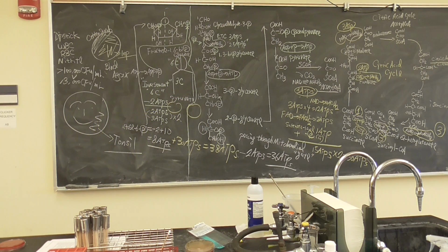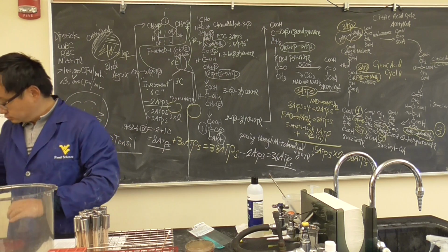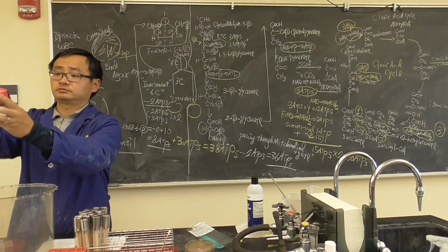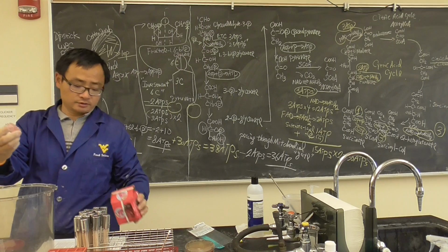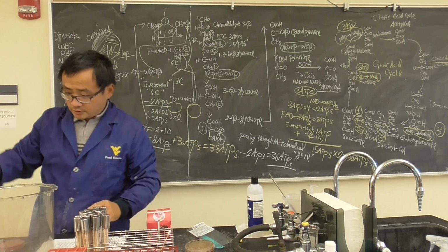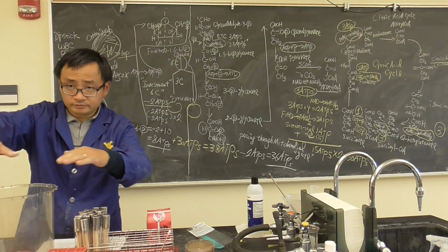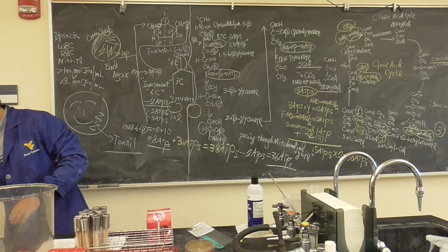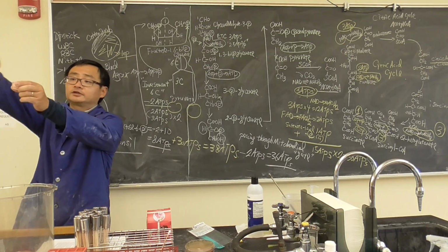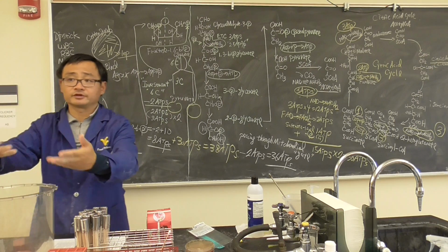We're going to use a jar. The jar is right here. This will be a candle jar. Yankee candle. I bought it from the outlet, I remember. So we're going to put all the plates right here, one by one. We may need 2 candles, so we're going to have to light the candle. You have to light the candle like you do smoke. So you put it in the jar, and then you cover it.